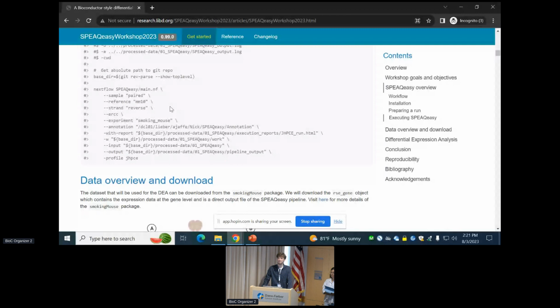I almost never just plainly use human, mouse, or rat. It's one of those species I'm usually adding something else into, so I've got to have a custom annotation. We do only use those three species, because we hard code some things like how many chromosomes there are for the species, but in terms of reference files, it's pretty flexible within those species. Yeah, if there's anything else, or we can, I guess we can move on to that.